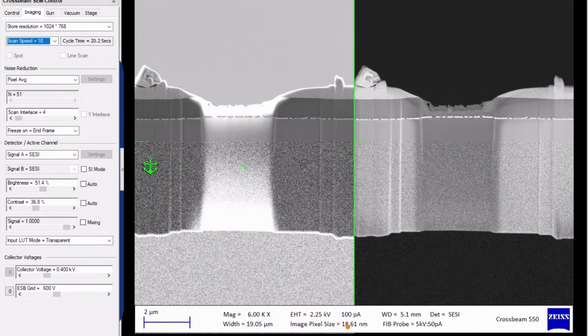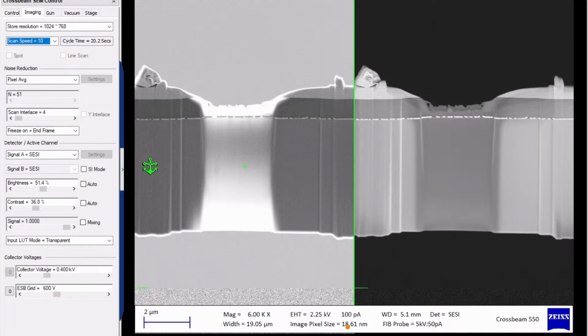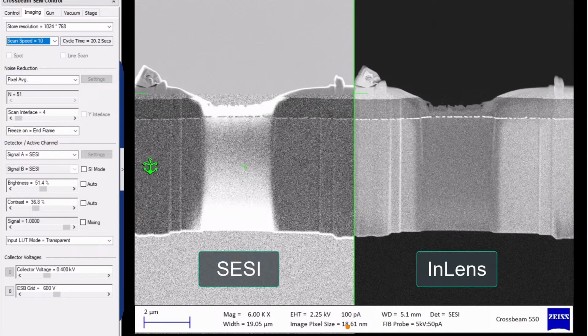And in this case, you can see I pushed it to the point where I don't really have much of the protection layer at the top. I'll move it back just a moment. So at the top in this, you can see where it's risky to go forward anymore, because you don't have very much of the protective layer at the very top.